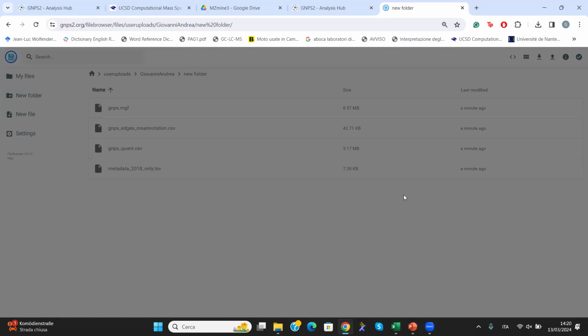No, okay, you have to use the simple one, not the full one. I think this can be answered better, Stefan, but the full one contains way more information that is not only unneeded, but can make your work fail. Actually, it contains way more information than we need for doing the molecular network.